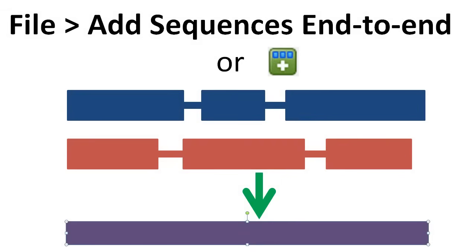By instead entering these sequences into MegAlign Pro using the procedure described in this video, the entire set of sequences in the multi-segment file, or set of files, will be treated as an end-to-end concatenation.